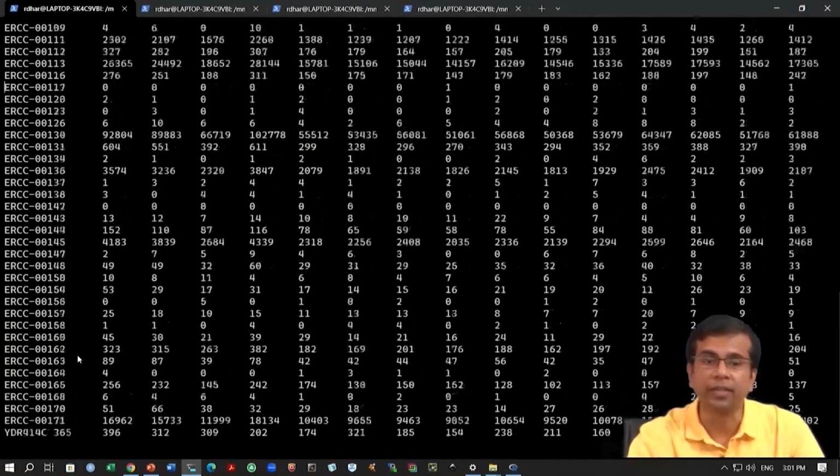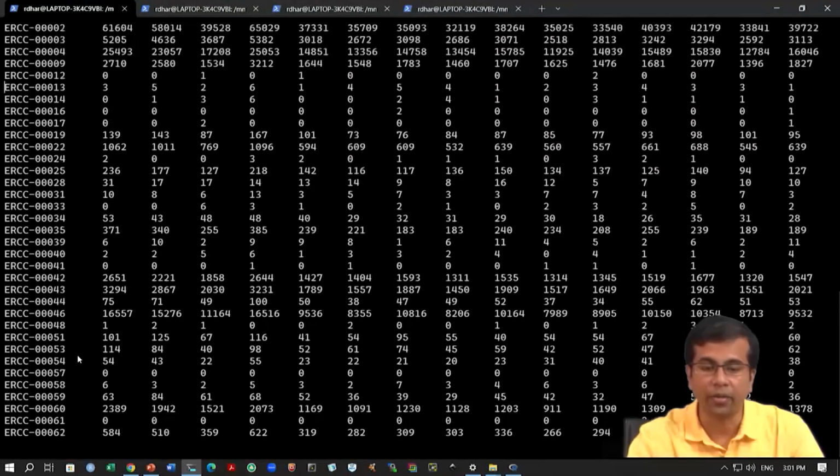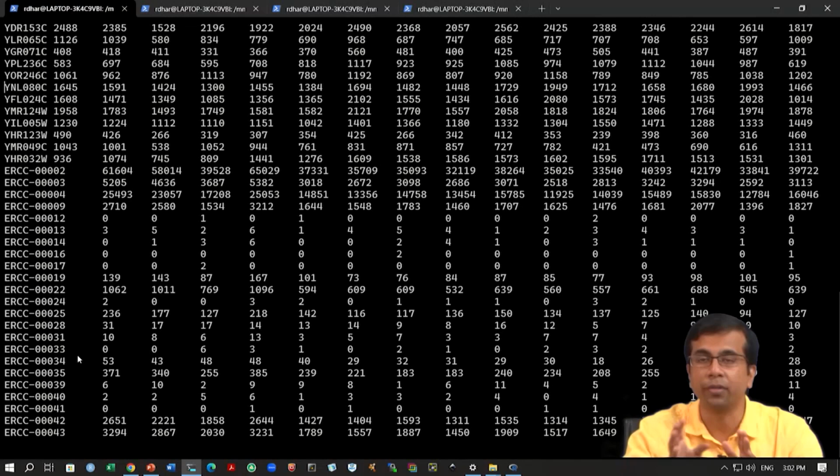All right. So, we can use this ERCC data now to normalize the data and counter or minimize the technical variation. You get the idea. We have added these spike-in mixes. Each mix contains multiple RNA molecules present in different numbers, and we add this mix in exactly the same amount across all the samples. So, there is no variation due to environmental conditions, etc. When we are preparing the library, we have isolated the RNA, and we add this mix to these samples. Then we get variation in the data, which means this is purely technical variation that we can now look into for patterns, and try to correct for as much as possible. So, this is what we are going to do. We will import this data in R, and we will try to normalize the data based on these ERCC spike-ins.